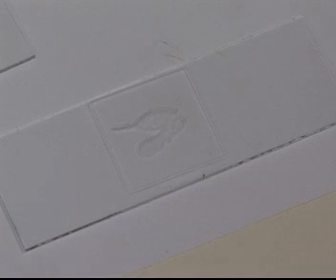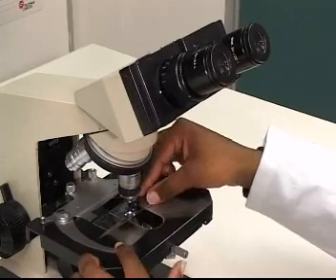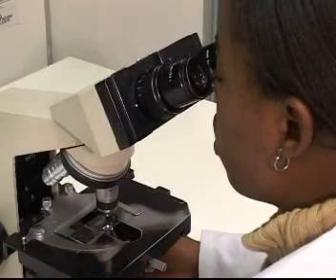Once it is in position, examine the epidermal cells that you have mounted, first using the low power and then the middle power objective. Notice how you are not able to see the parts of the cells properly. Why do you think this happens? Think back to the previous lesson for your answer, and I will give you a moment to write down your answer. Teacher, please see that the students are answering the question.